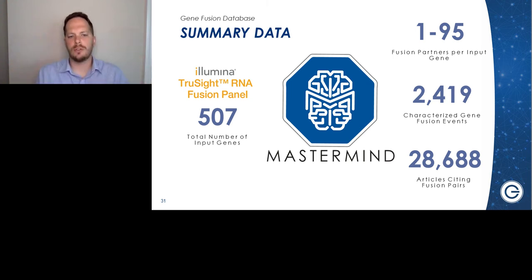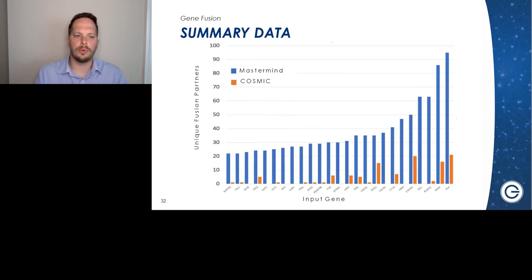And all of this information was automatically assembled using Mastermind's GLP, but then exhaustively manually reviewed to check the evidence, just as I talked about one of the guiding principles favoring the human interpretation over a black box algorithmic assessment.